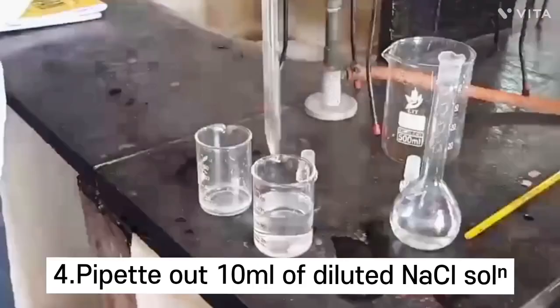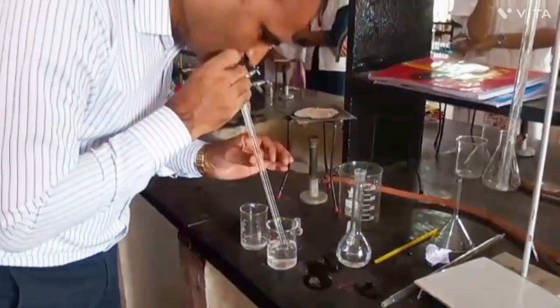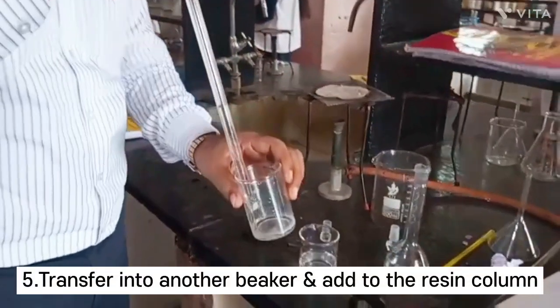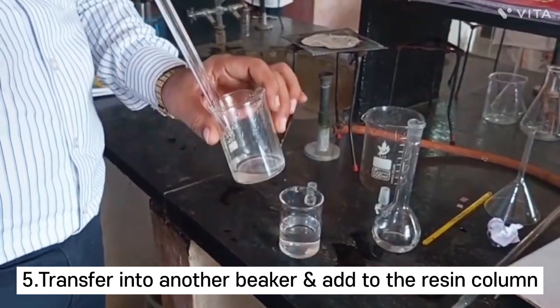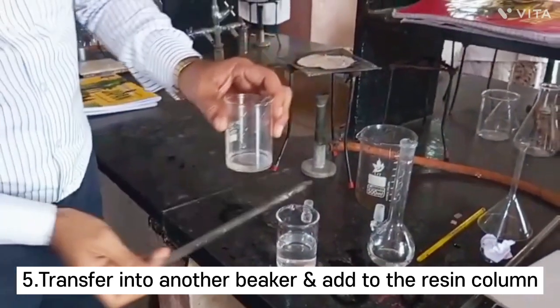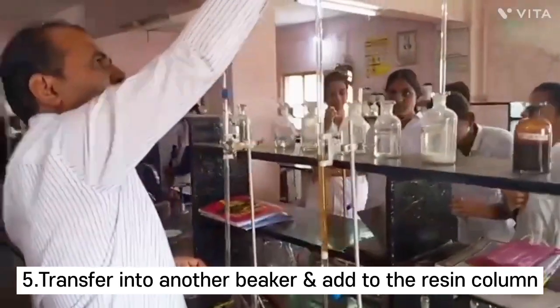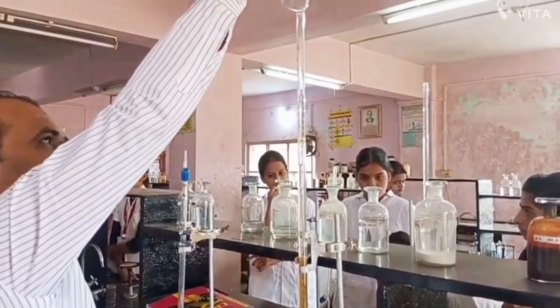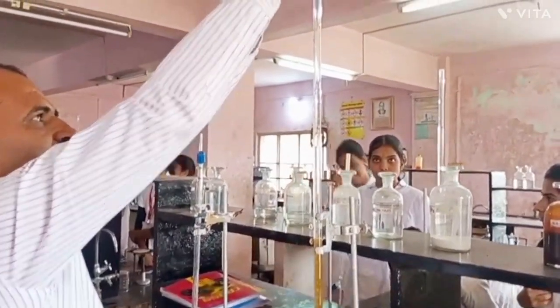Pipette out 10 ml of the diluted NaCl sample solution, transfer it into another beaker, and add it into the column to allow the exchange between Na+ and H+ ions in the resin column.